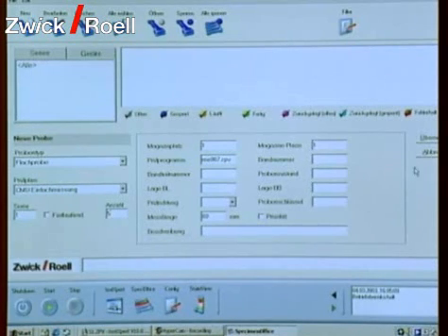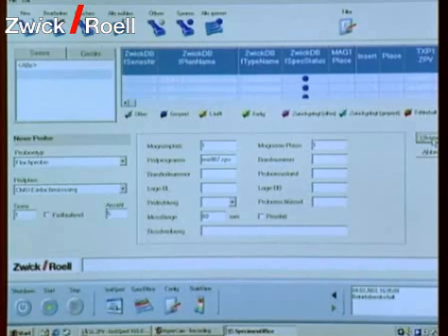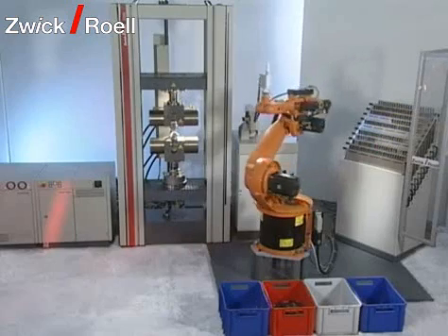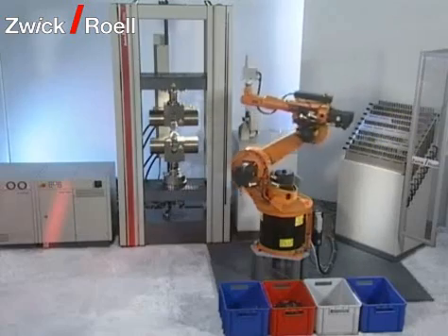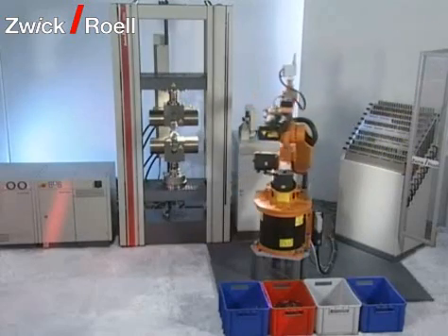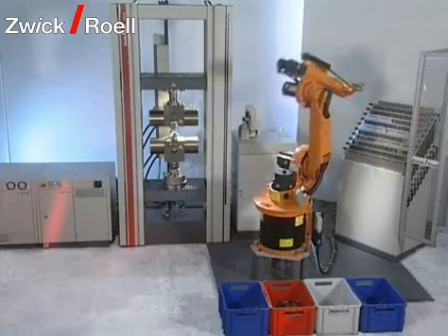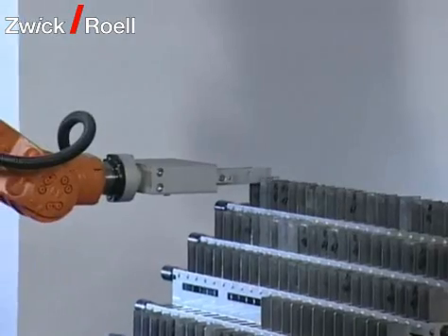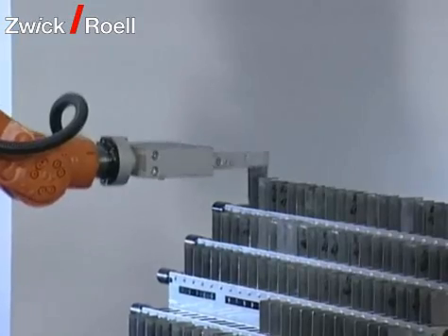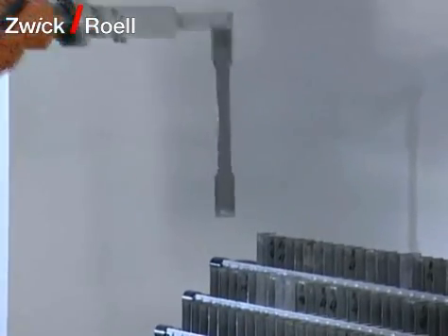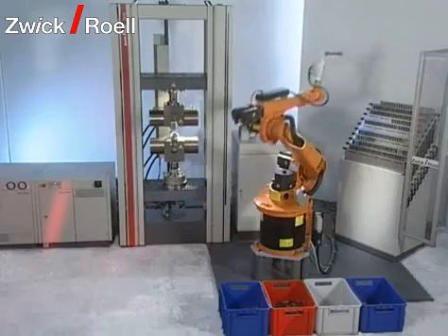Alternatively, these data may also be supplied automatically through a host computer system. Now the robot takes the first specimen out of the magazine. The order of the specimens to be tested may be defined individually.